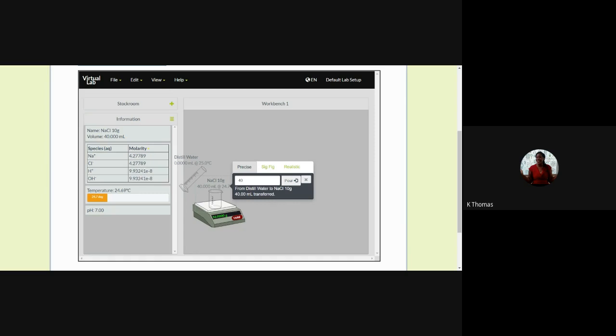So the water temperature went down and now it's coming back up. And I can't stop now. So I'm watching back over my video to see what's the lowest change I can see on the video.